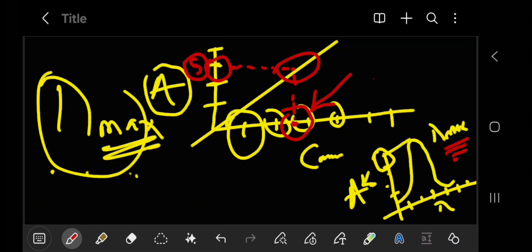So you have your working wavelength, lambda max, and you know the maximum absorbance at that wavelength. That is what you will find. Once you've plotted the graph, you locate it, extrapolate, then find the concentration of the absorbing species. This is called your calibration curve.